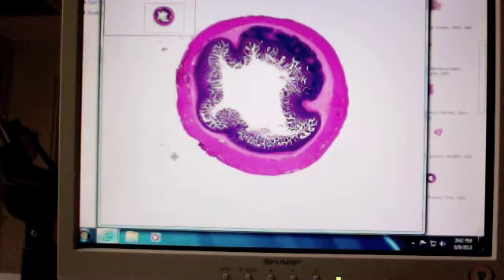Now in this case here, for me to be able to show you that we're really looking at the outside of an organ, not the inside of an organ, you would... Sorry, what if you're talking about the outside of a vessel with that question? Now, the outside of a vessel is going to be connective tissue. Okay? The outside of a vessel won't have a mesothelium. Okay. So, actually, except in the aorta. When you're looking in the pleural cavity, part of the aorta comes out. That's actually going to sit in the pleural cavity. You would expect that to have a mesothelium on the outside of it. Okay, but it's one of the few places, and let's not go there until we do cardiovascular.